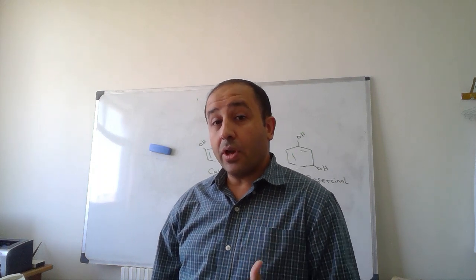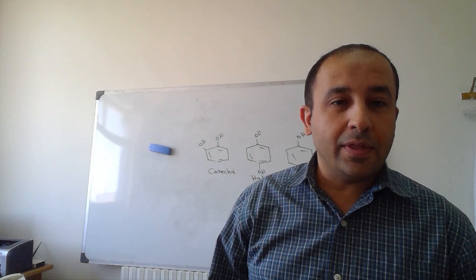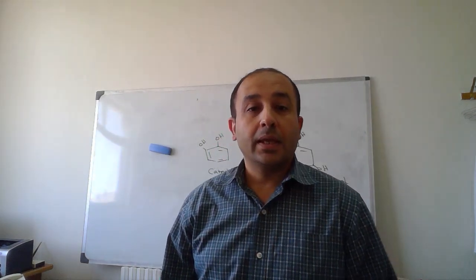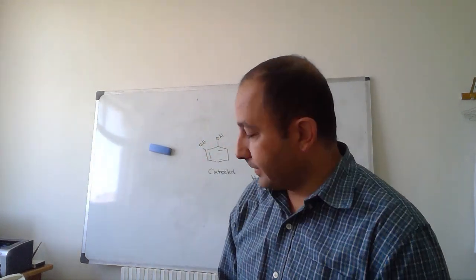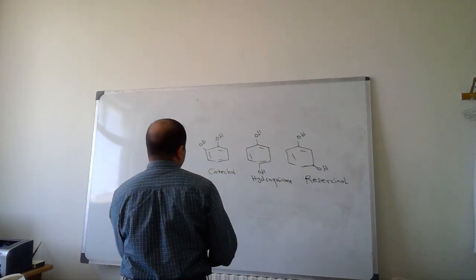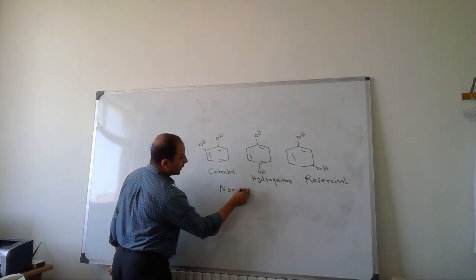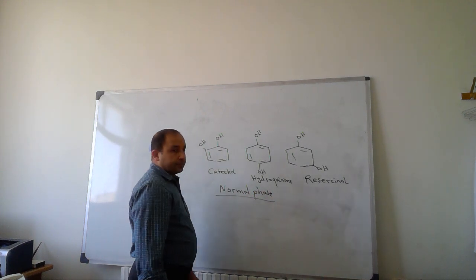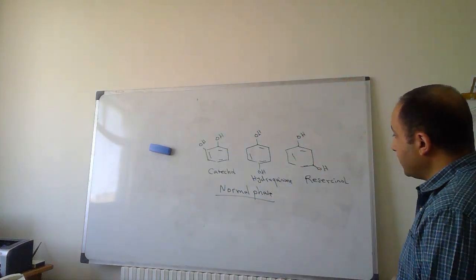So the adherence of hydroquinone should be more than the others, and catechol should be the least able to adhere to silica. So we will choose normal phase silica.